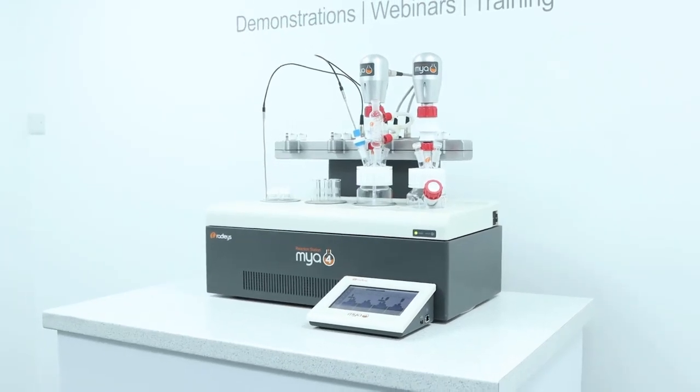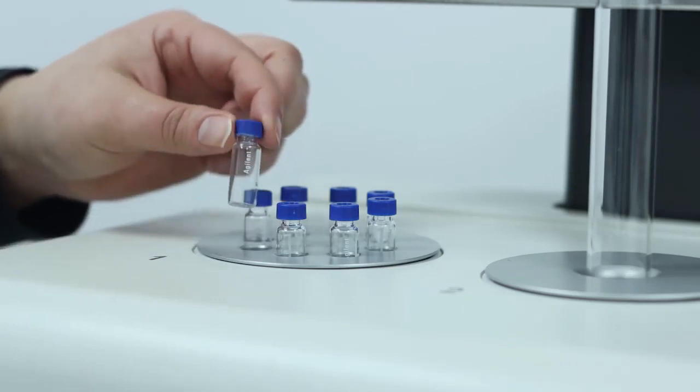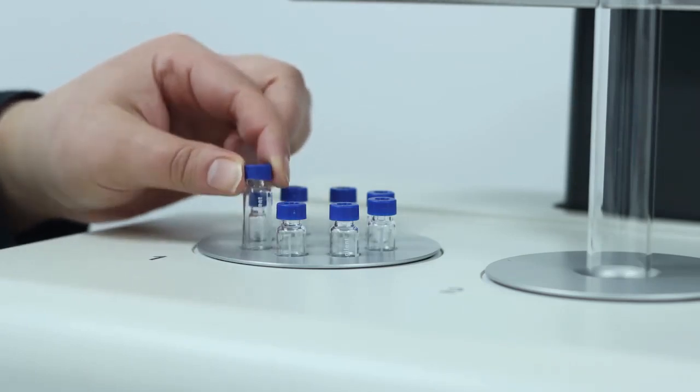The Maia 4 reaction station accommodates a wide range of glassware, including a variety of tubes and vials, such as HPLC vials.